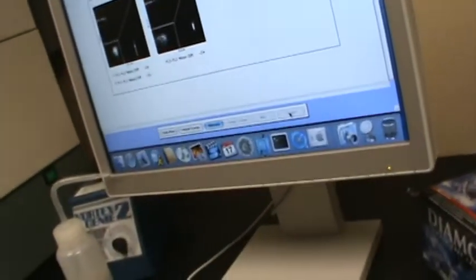And now you put your mix tube. Okay. And then you hit start. Initiate. What does the menu mean? Manual is where, whereas this is automatic, you have to go in and set it up yourself to run.